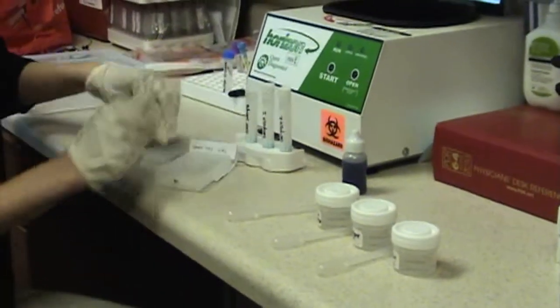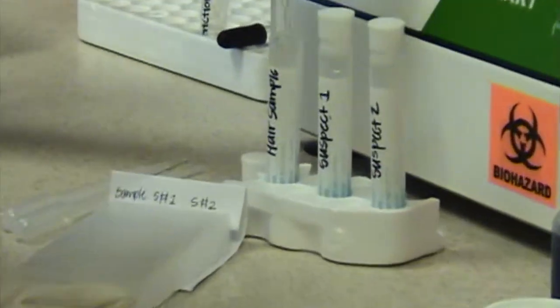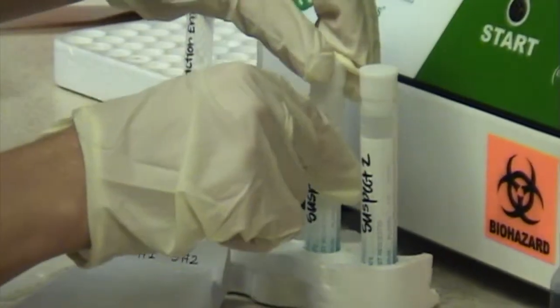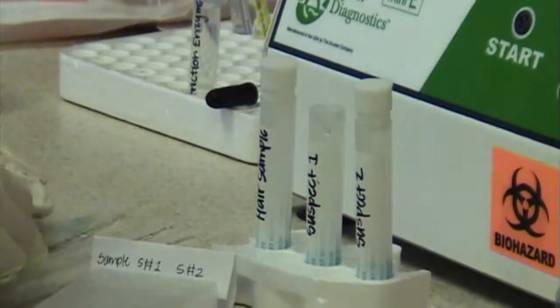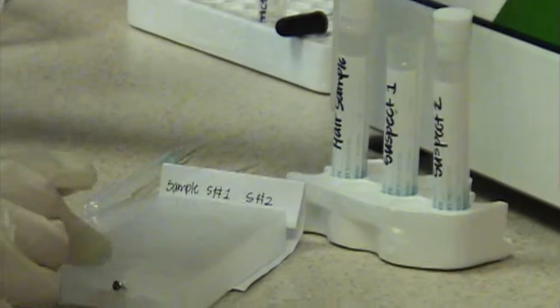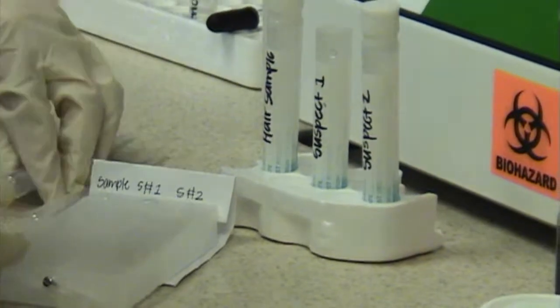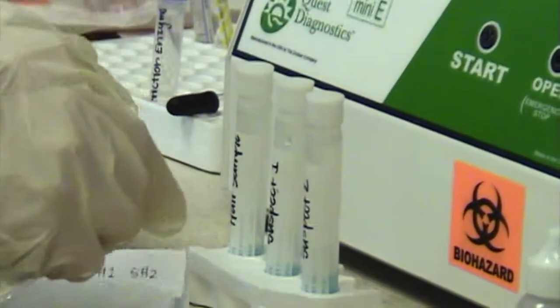The hair sample from the crime scene will go in the first well. Next, in the second well, is suspect 1. And last is suspect 2.